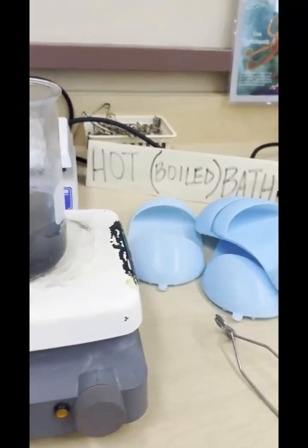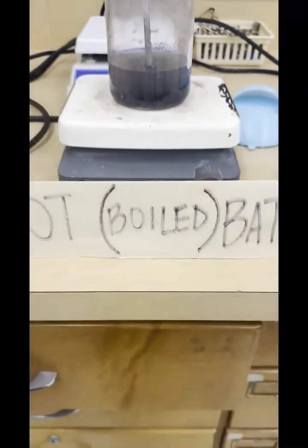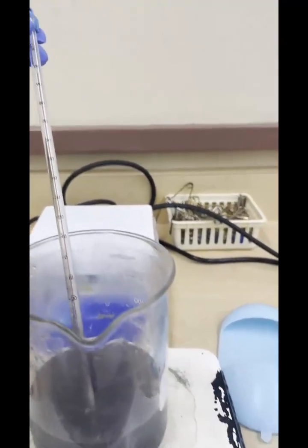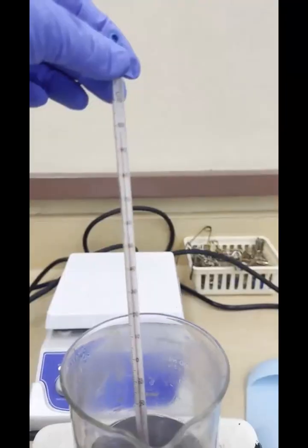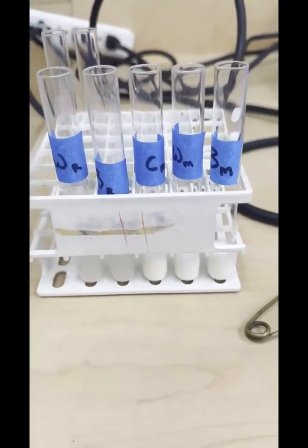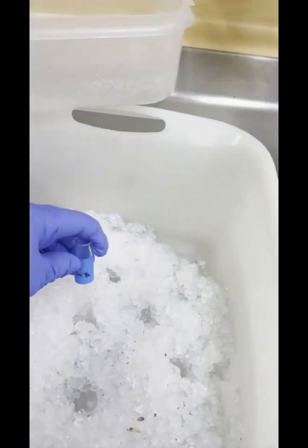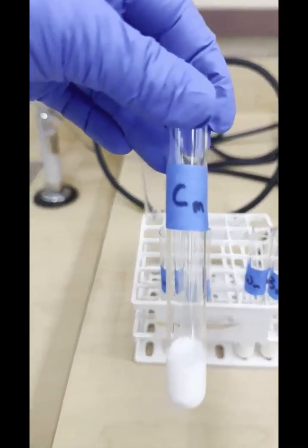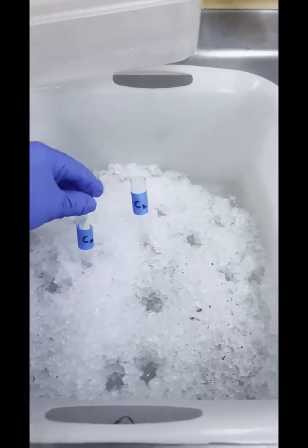And here we have our hot bath, right? And this is at 100 Celsius. Here, I'm going to place the cold enzyme into the ice bath right here. The cold milk also into the ice bath right there.